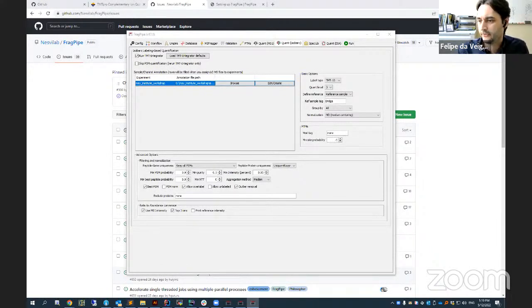When you add FASTA, do you recommend adding isoforms? In which case should I add them? Well, it depends on what you're trying to do. For a standard experiment, if you're not looking for isoforms or variants, then we suggest not adding them. Isoforms and variants can complicate the analysis, especially the protein inference step.